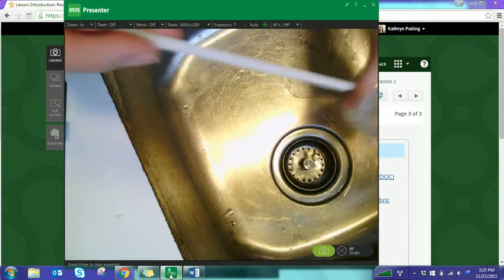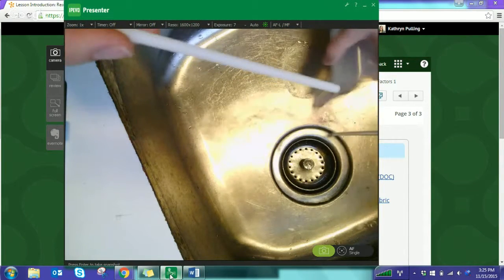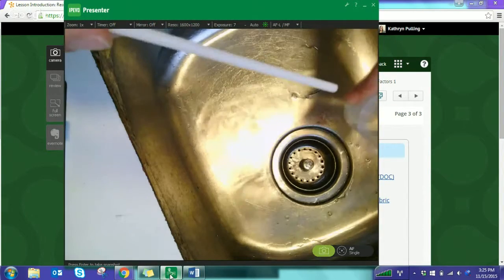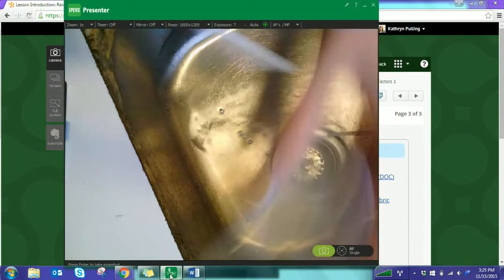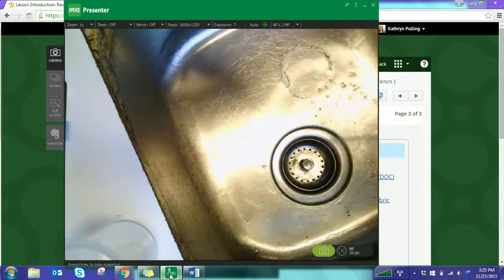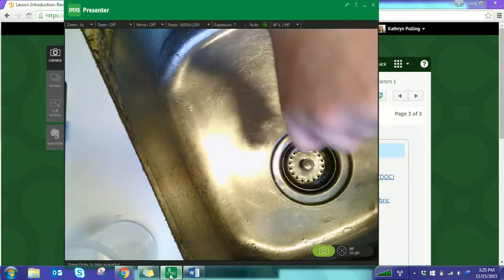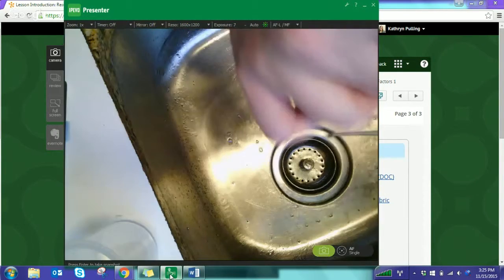Then I'm going to rinse out my beaker several times. Alright, I'm going to rinse off my stirring rod for a little bit, making sure that I'm getting all sides, the whole thing, anywhere that would have been in contact with the reaction.